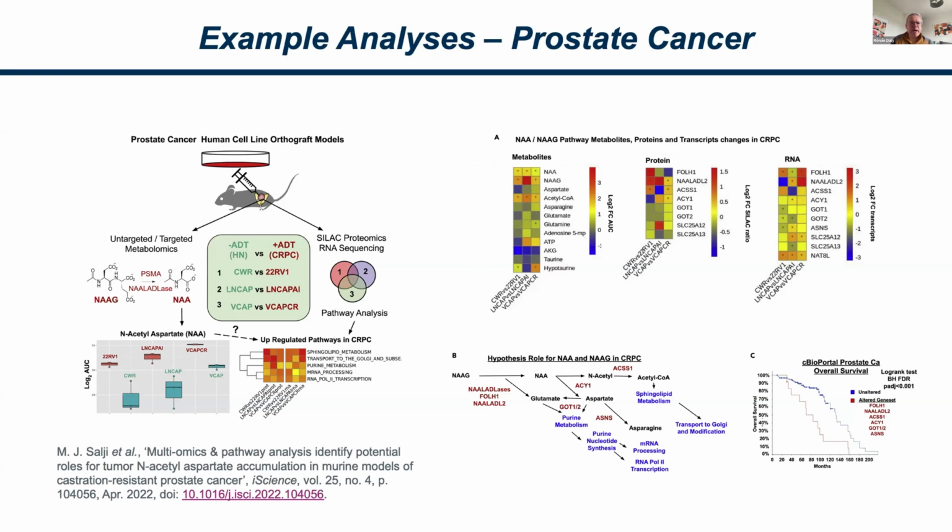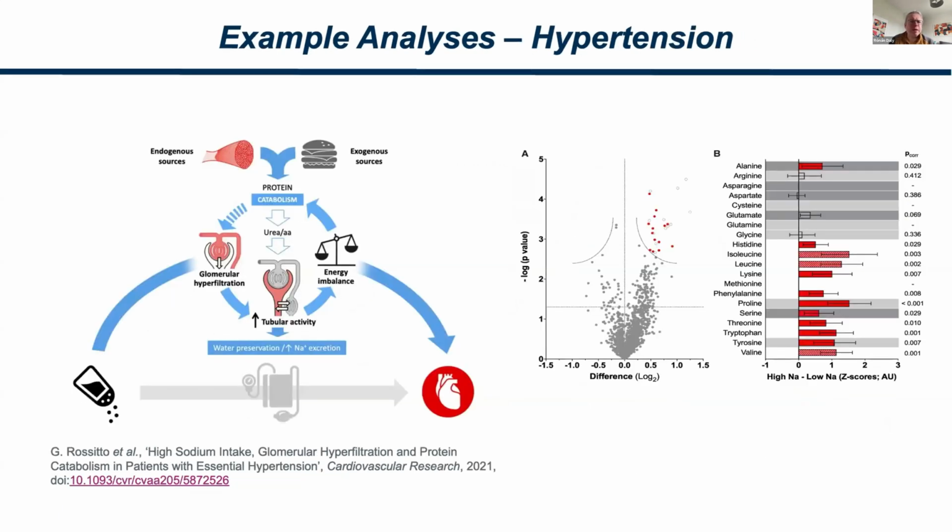We could see in this case how the changes in NAA are cascading downstream and affecting other subsystems inside the system of interest. By doing so, we're able to make that mechanistic model, that real connection underpinned by actual evidence and knowledge, to make sure that we can make a very good and sound conclusion about how our particular experiment is working when we have two different types of cancers. I think the results are very robust and very reliable, and it works quite well in that situation.